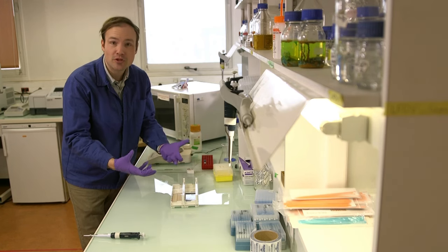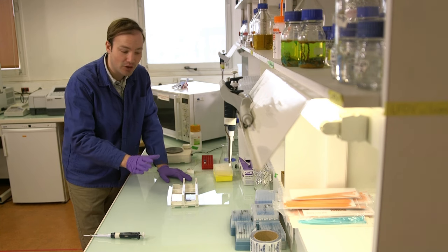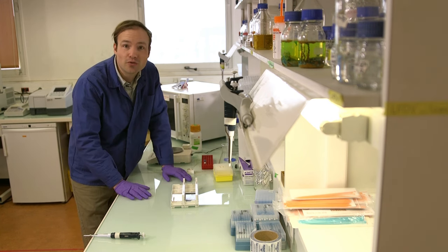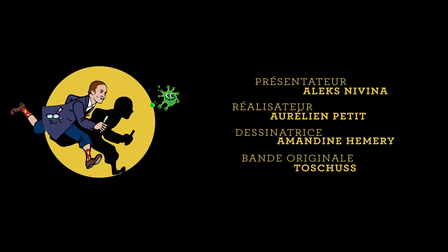After the gel is poured, it will take about 30 minutes at room temperature for the gel to cool, for the matrix to be formed and create a gel that we are ready to load and use.